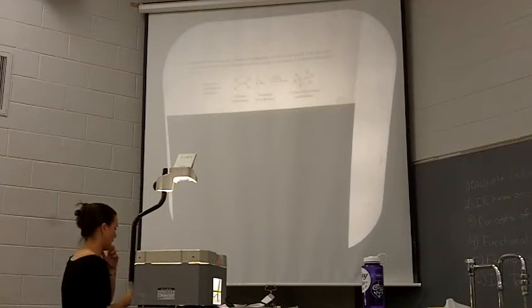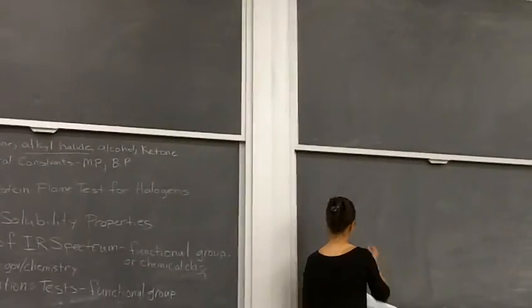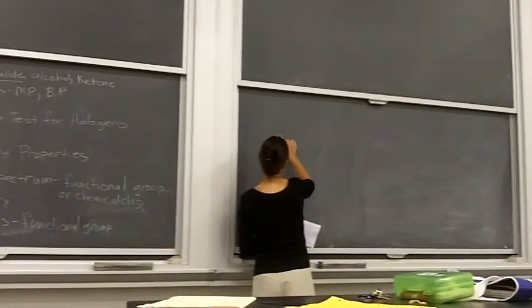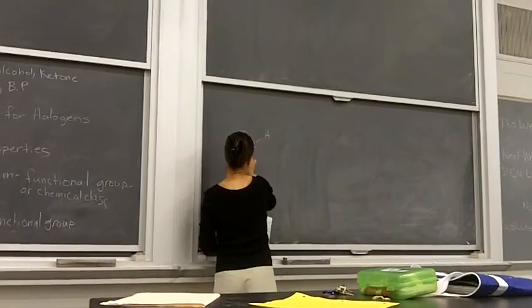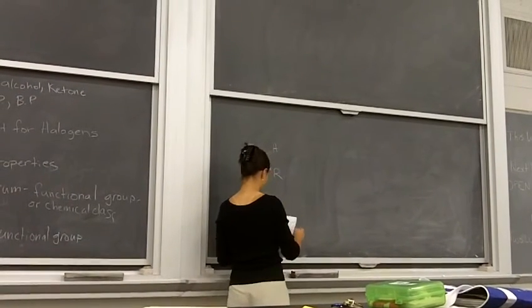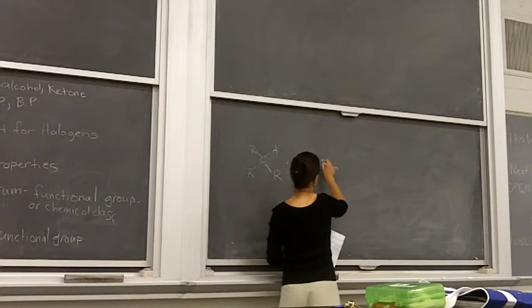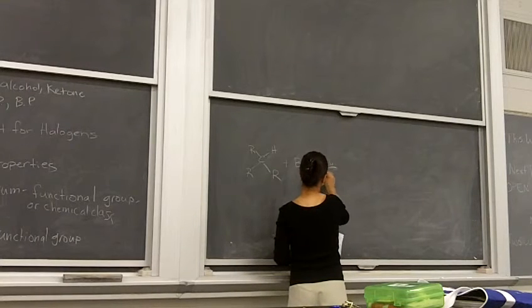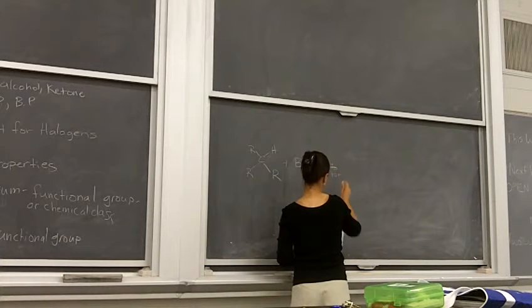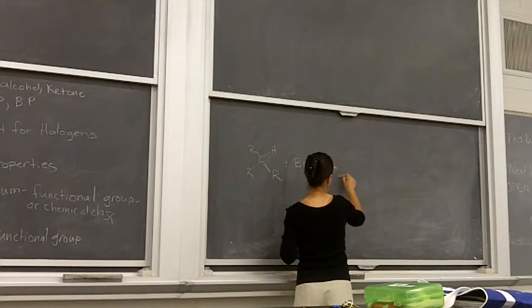Now, another reaction that happens with the bromine, so there's another piece to it besides just counting drops, is that it can react with alkanes as well. Say you have an alkane reacted with Br2, and you need a little heat or light for this to happen, but you're not completely in the dark in organic lab, so that's enough light for this to happen.